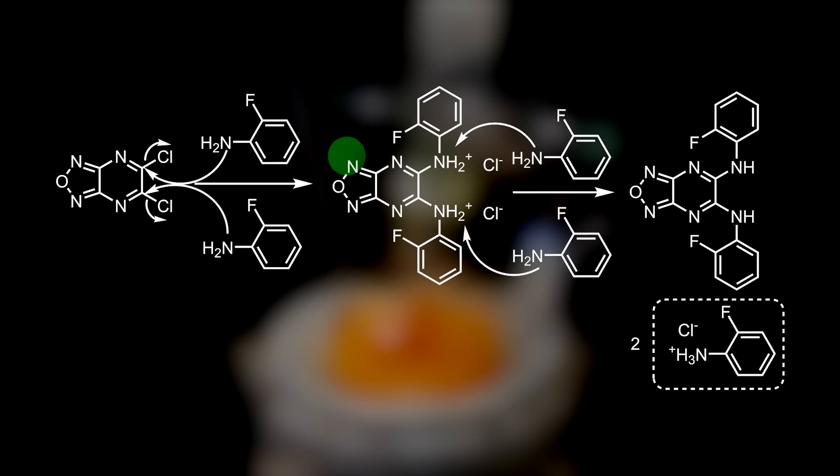Another 2-fluoroaniline molecule, which is a base, picks out the remaining proton and chloride from the protonated intermediate to form 2-fluoroaniline hydrochloride, which precipitates out of solution as a white solid. We are then left with BAM-15 as the final product, which is a yellow solid that will stay dissolved at this temperature.